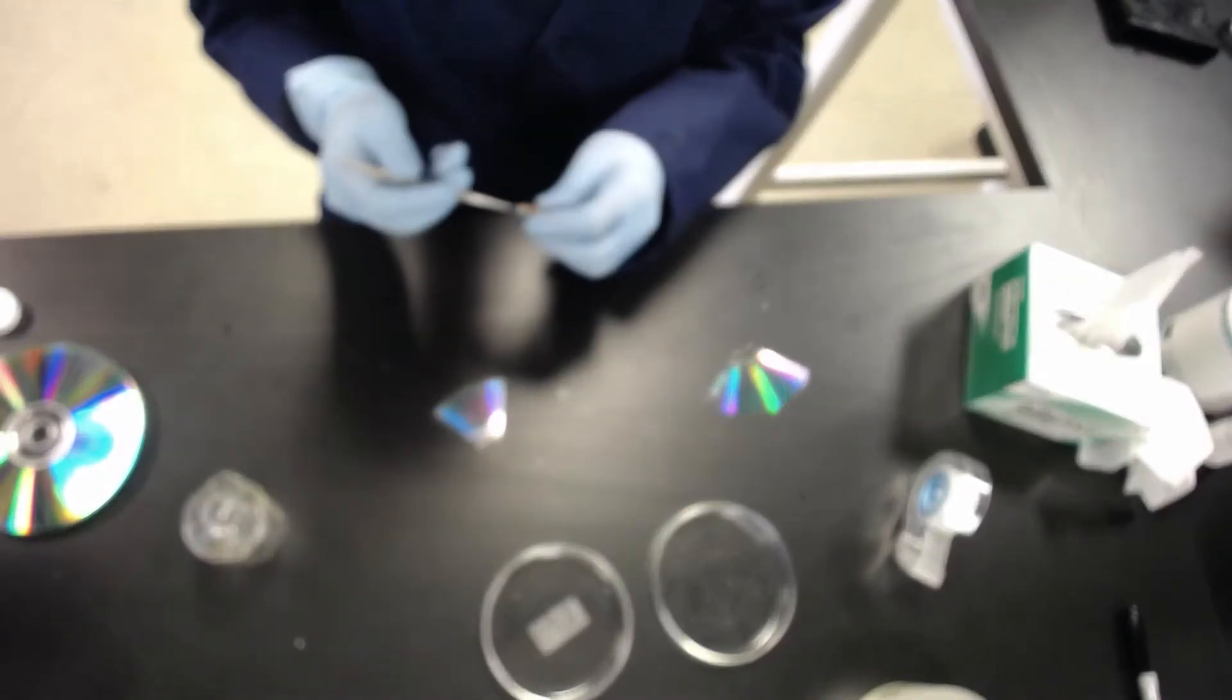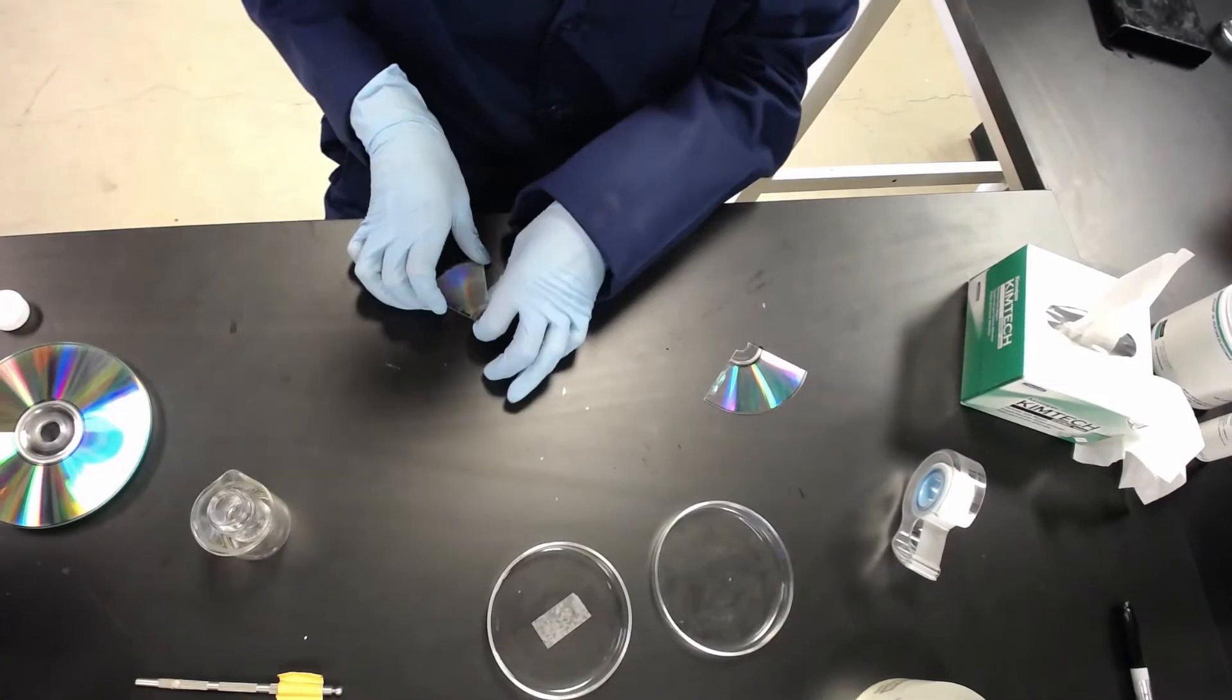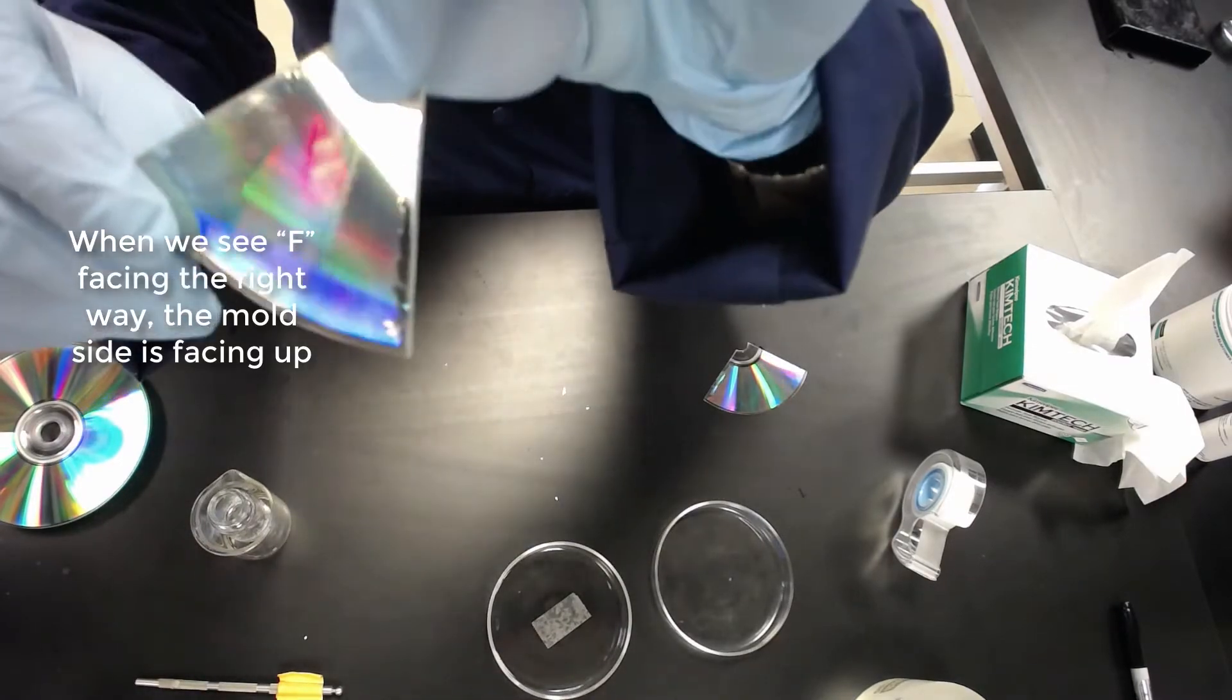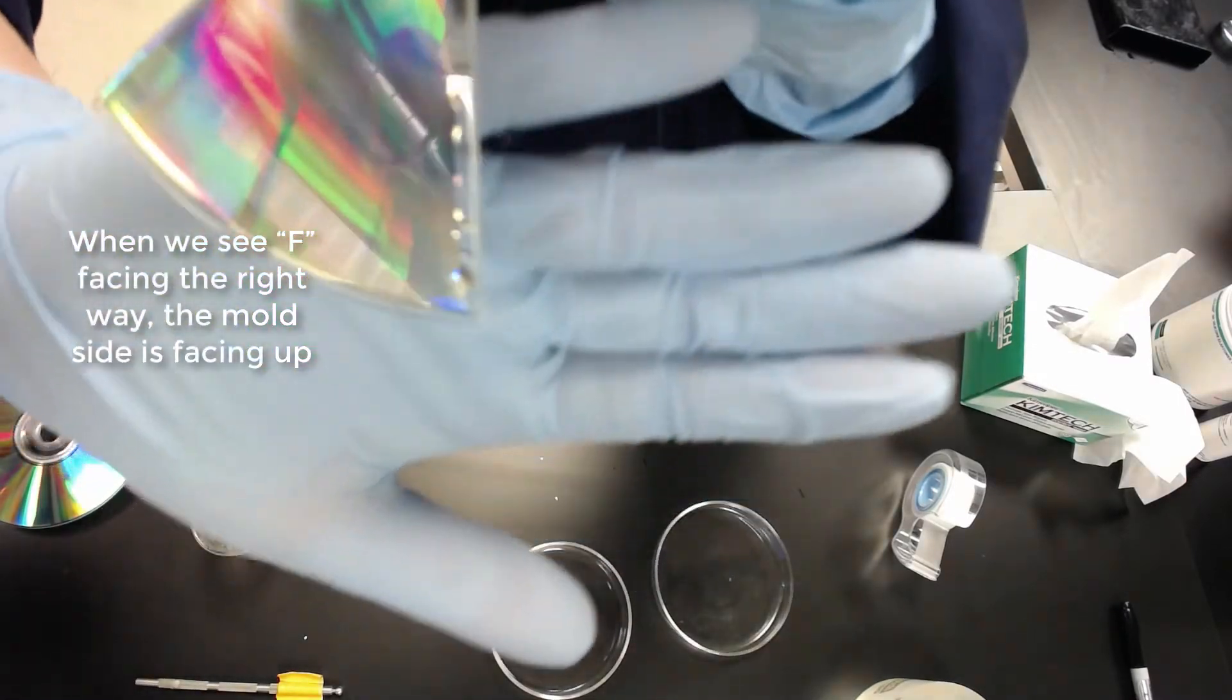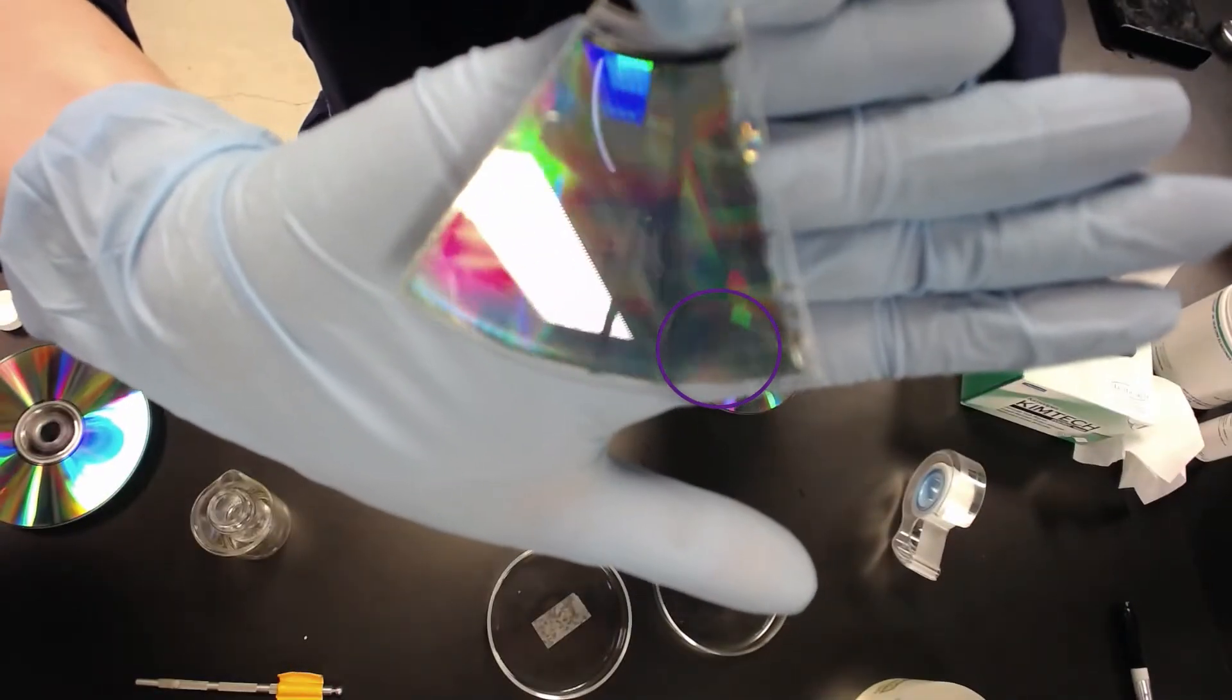So that when we flip it over, we'll be able to tell which is the side that has the mold on it. I'm not sure if you'll be able to see that. You can maybe see there's a little F in the corner now that's backwards.